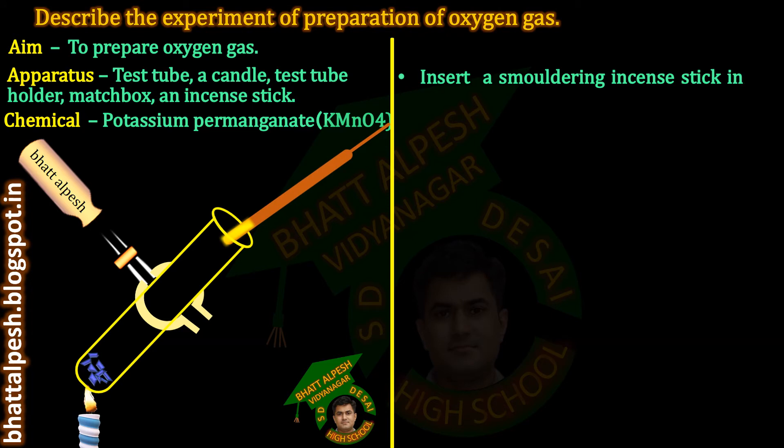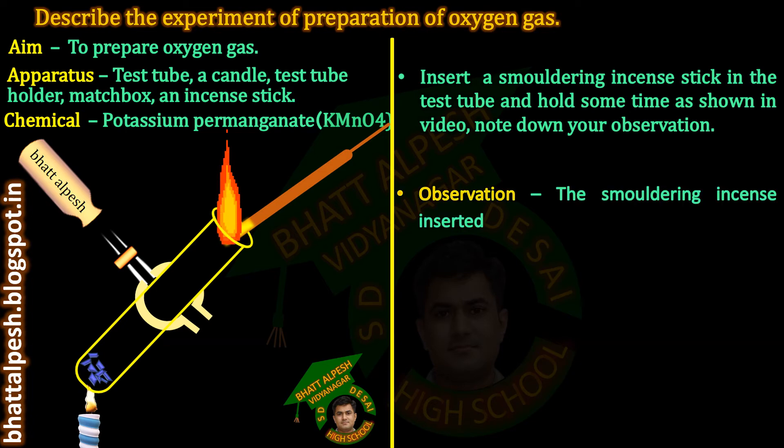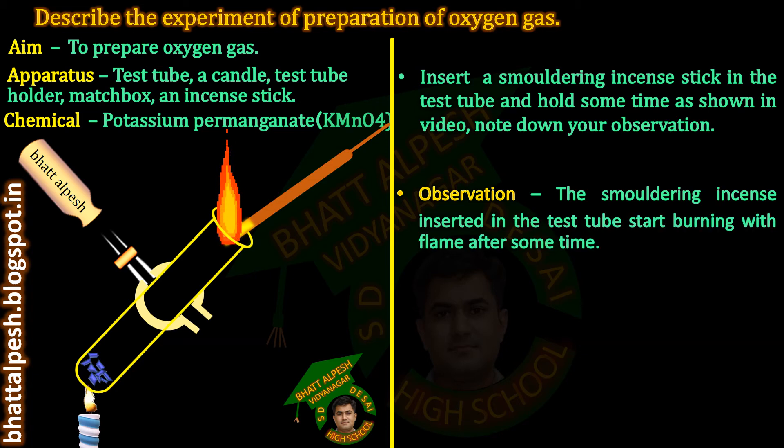Insert a smoldering incense stick in the test tube and hold it for some time as shown in the video. Note down your observation. Observation: The smoldering incense stick inserted in the test tube starts burning with flame after some time.